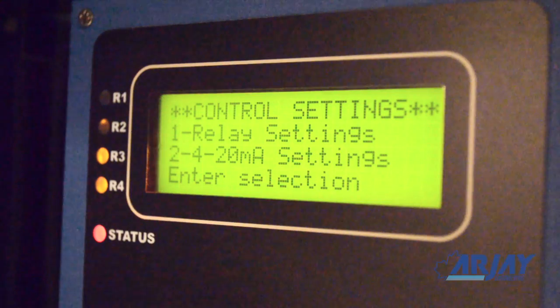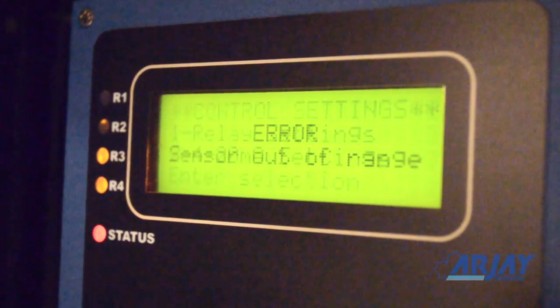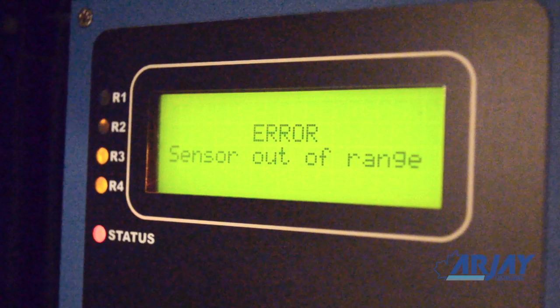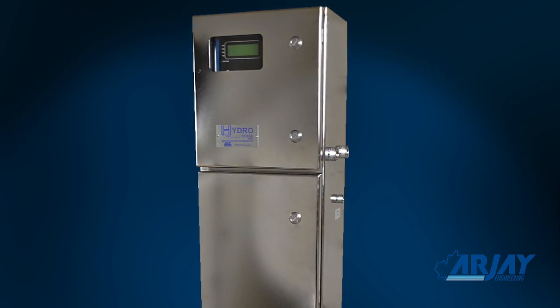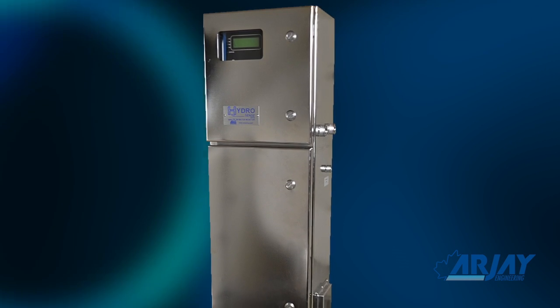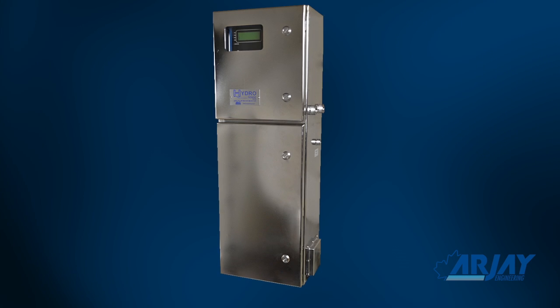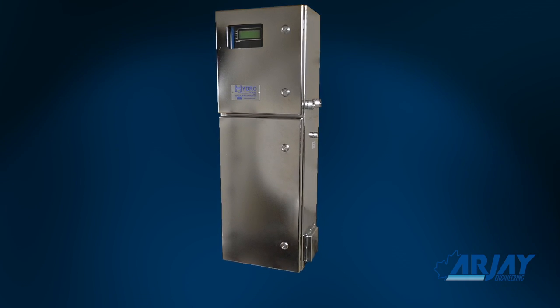User diagnostic checks can be assessed through the keypad, and automatic diagnostic checks will be displayed on the screen if any concerns are identified. Routine maintenance is the most important aspect of any instrument. Be sure a firm cleaning schedule is put into place. Take advantage of the unique RJ design that makes this a simple two-minute procedure.